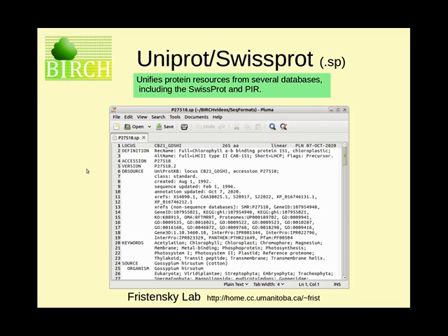Having said that, I just want to point out that part of the rationale behind the BioLegato programs in Birch is to save you the trouble of having to interconvert file formats all the time. So if you read in, for example, a GenBank or Swissprot entry into one of the BioLegato programs, BLDNA or BLProtein, it will know the file format that's needed for any program that it runs, and it will convert the sequence into the appropriate file format when it runs the program.